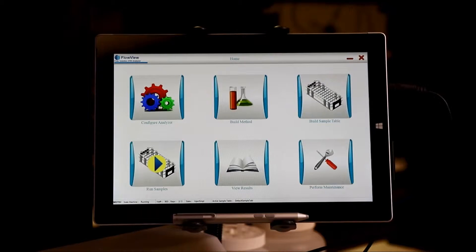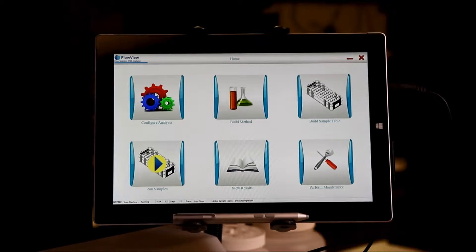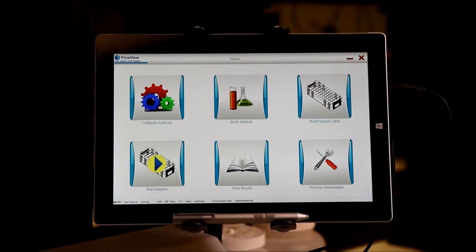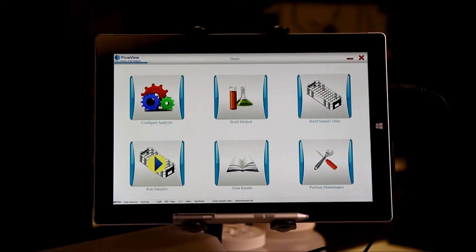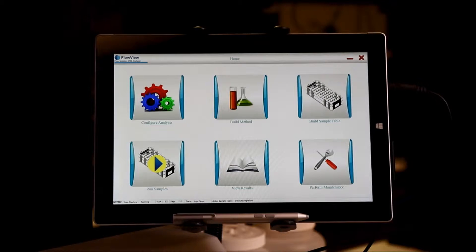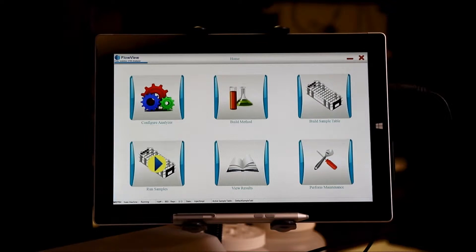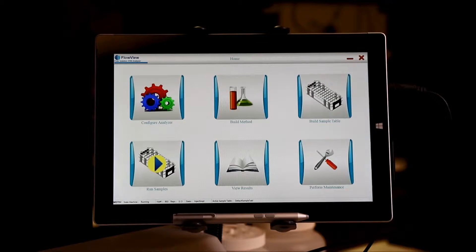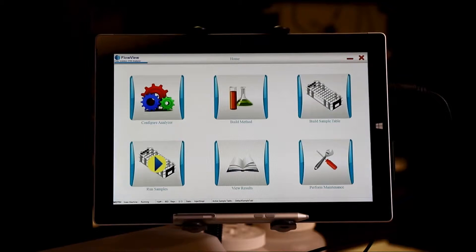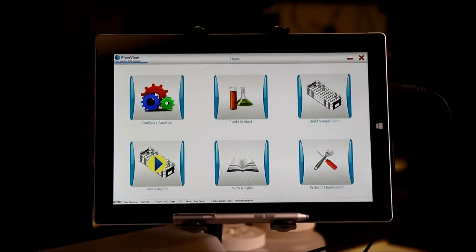So this is the FlowView interface, our latest generation of flow analysis software. What you see before you is a simple menu aligned left to right, top to bottom. It's interfaceable with a Microsoft Surface so that it's designed to be a touch screen interface.